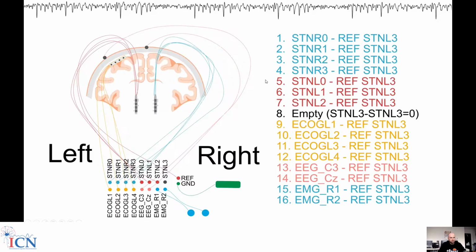Yeah. Is it okay to ask this? So you mean you digitally subtract it, or you actually change something in the hardware configuration so that it becomes the actual reference for the amplifier? So I don't change anything, but the hardware expects a reference. There's no other way, basically. You need to add a reference in the hardware to record. Mm-hmm. So the hardware subtracts it. Okay.